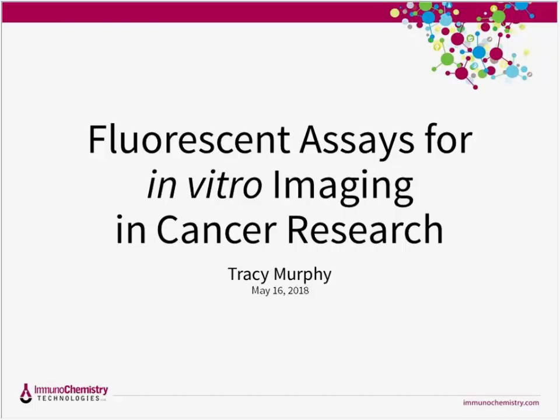Today's talk will be focused on looking at how some of the tools that ICT offers for fluorescent imaging can be applied in the context of cancer research and oncology. So some of the things we'll be touching on, we'll learn how to quantify caspase activity in vitro, how to measure cathepsin activity, detect mitochondrial membrane potential and depolarization, differentiate necrosis and apoptosis, measure serine protease activity, and finally how to detect pyroptosis. We'll also be discussing the utility of this technology in the current cancer research landscape.